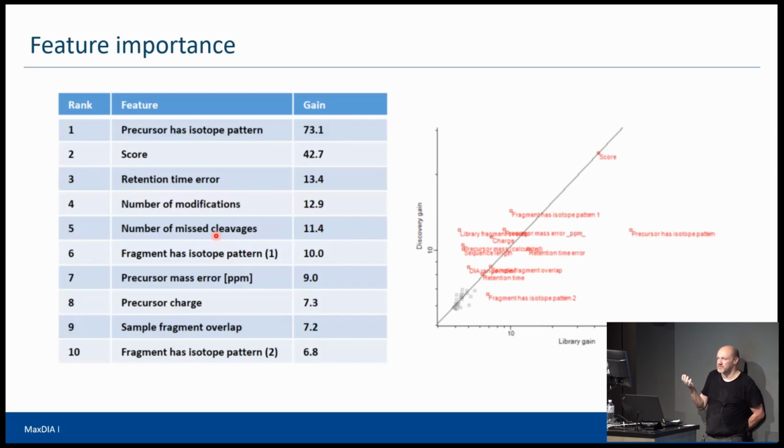If you have an alternative explanation without any modifications, then even if everything else would be the same, the matching parameters and everything, you would still say, yeah, but the one without modifications is more likely to be correct. That's actually very similar to what we do in DDA. In DDA, what the posterior probability does is exactly the same thing, that it puts all this a priori information into the score. Right? And you have the same here, just done in different ways. So here it's not done with posterior probability, but it's done with the machine learning output. Thank you.